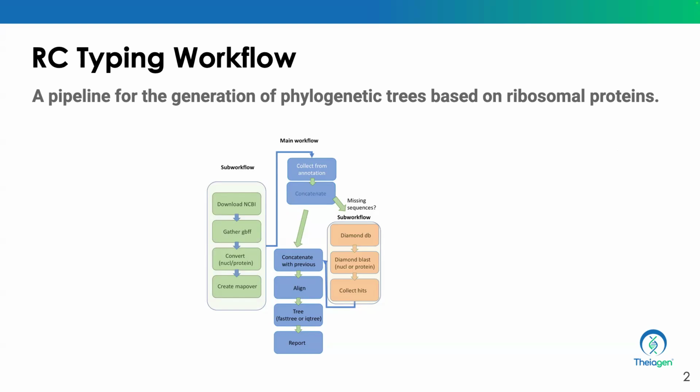Okay, coming back to my slides here. So you have the main workflow in blue, and then you have two separate sub workflows.